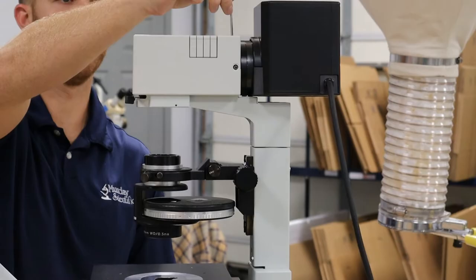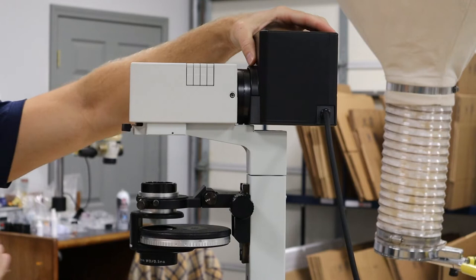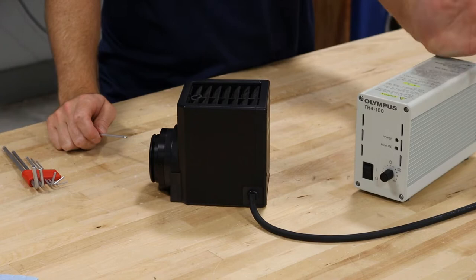First off, I'm going to loosen this screw on the top — always hold the lamp house. And then there's another one here and I'm going to remove the lamp house. On these IX scopes, a lot of times they'll be plugged into an Olympus TH4 transformer or some kind of transformer. They could be plugged into the base.